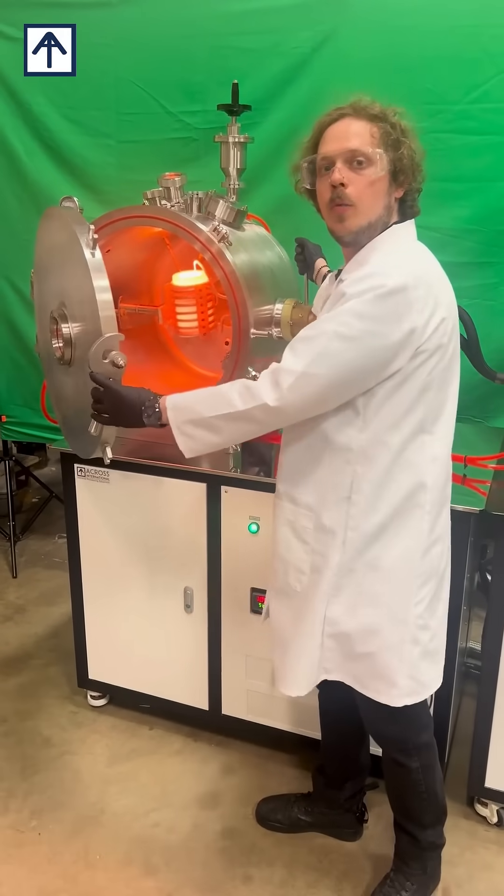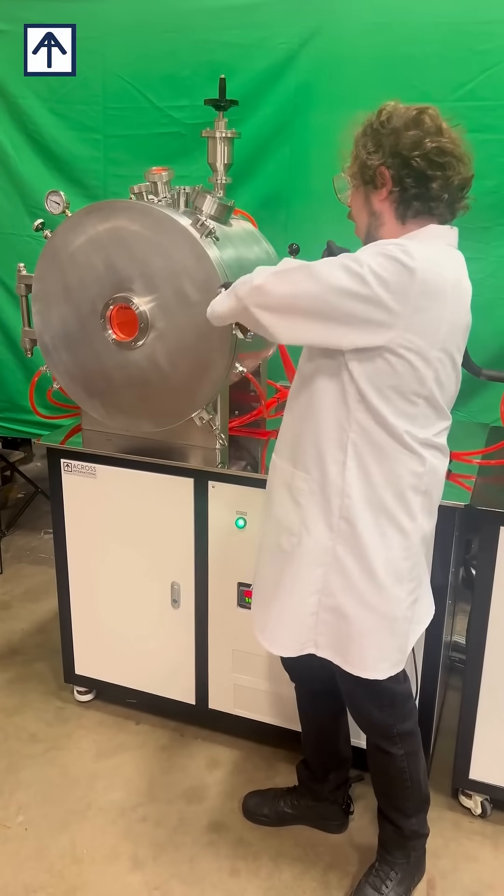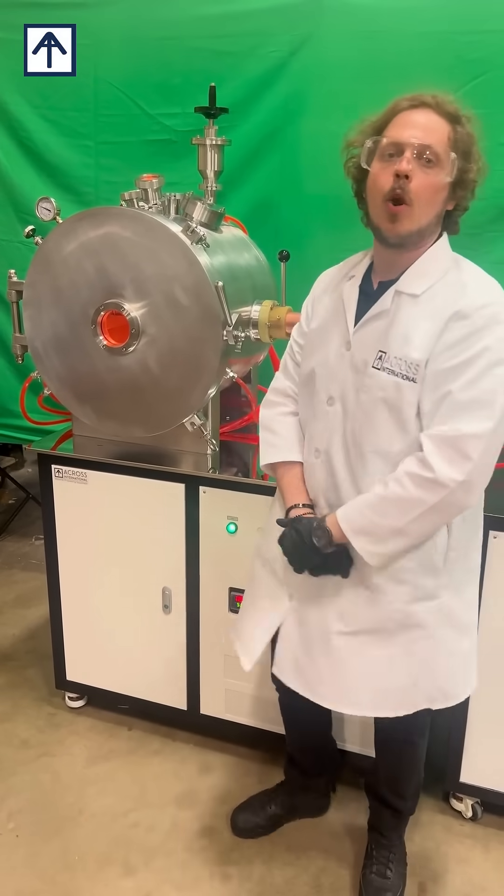As you can see, this is insanely hot. We may equip this with a manual vacuum feed and a couple of other options that you may learn more about at crossinternational.com.